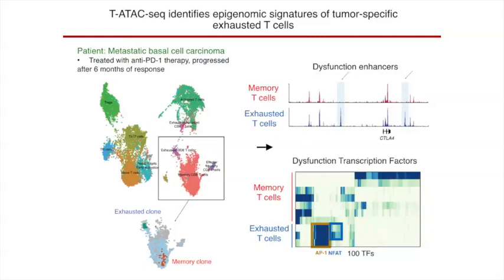So it's actually about 12,000 T cells. Okay? And so you can see a population of Tregs, some CD4 T cells of various flavors, activated T cells, and then you can see this small cluster of actually exhausted CD8 T cells. Okay? Here. And so now we can pair this epigenetic information with the TCR profile and highlight where the expanded clones are within that population of T cells. So now in this plot below, the colored dots are an individual clone.